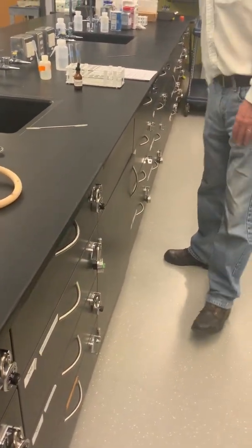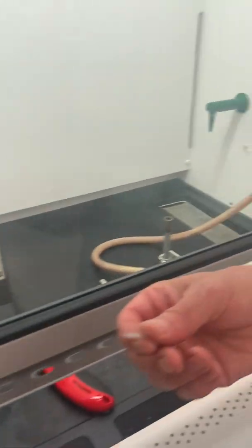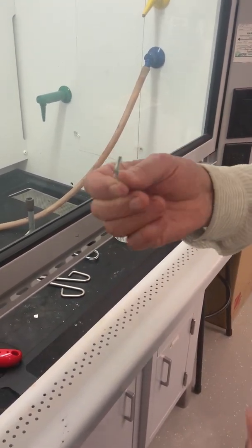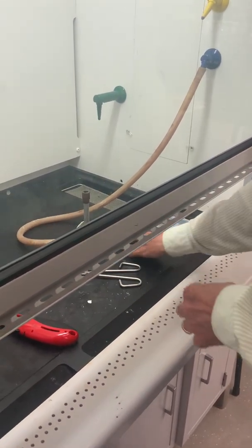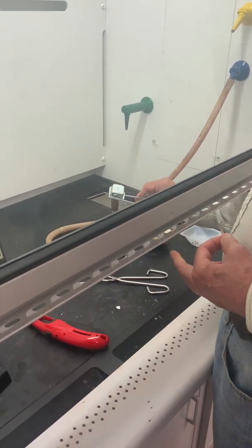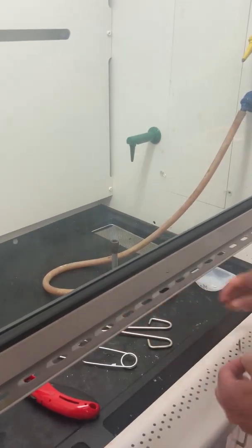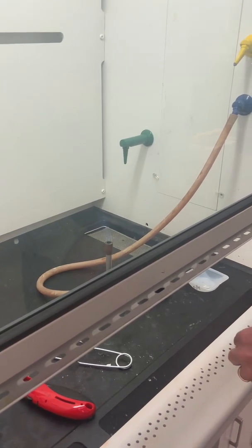Reaction number 4 is a combination or synthesis reaction where we take a simple substance, in this case a metal, a strip of magnesium metal. Magnesium is what we call an active metal, meaning that it is in general pretty reactive. And we're going to once again use heat to make this reaction go faster, doing this under the fume hood. And you'll see why in just a minute.